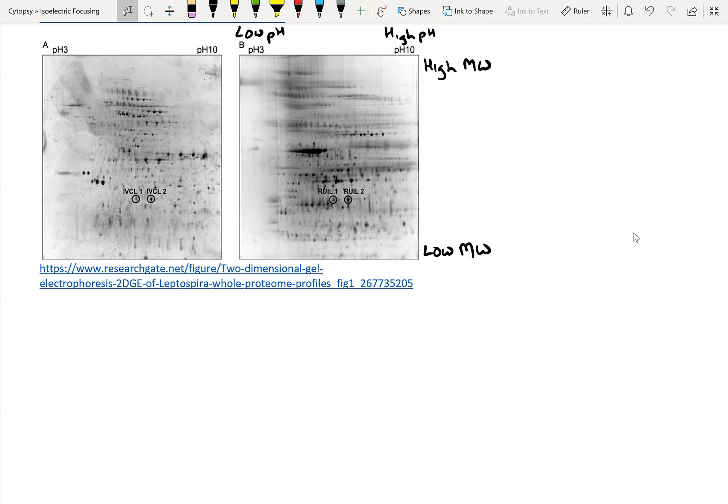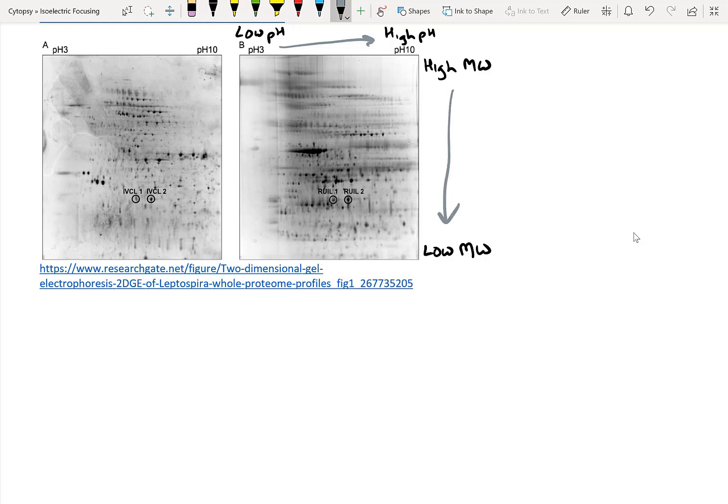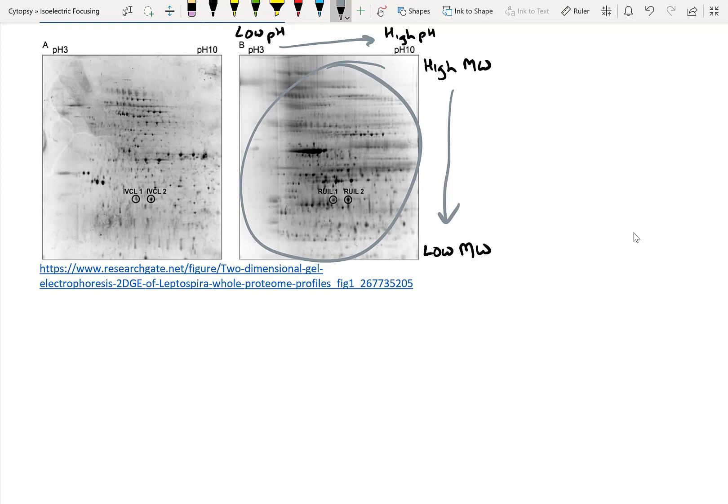Another cool thing you can do with isoelectric focusing is to do SDS-PAGE after isoelectric focusing. This is called 2D gel electrophoresis. What happens here is first, you run isoelectric focusing so that you can separate proteins based on their charge, and then you run SDS-PAGE so that you can separate proteins based on their size. So you can see here, you can actually add a really complex mixture of proteins inside your IPG strips, separate them on charge first, and then run SDS-PAGE and separate them based on size so that you can get a full profile of all the proteins that you have in solution. Of course, this kind of data is very complex to analyze and you need proper software to do it.